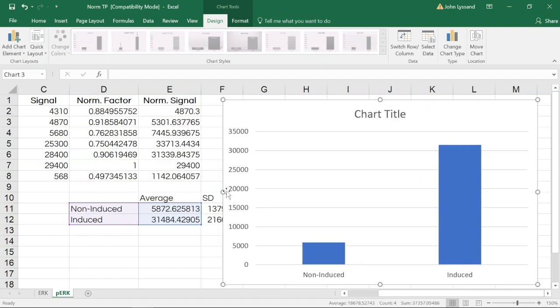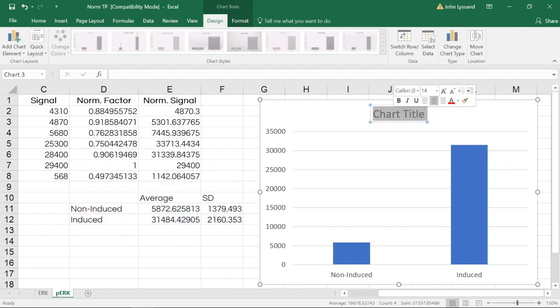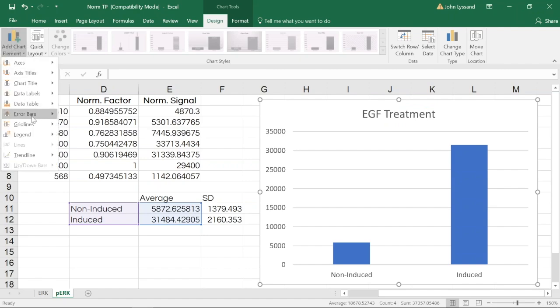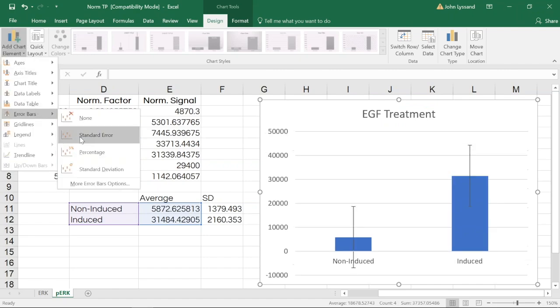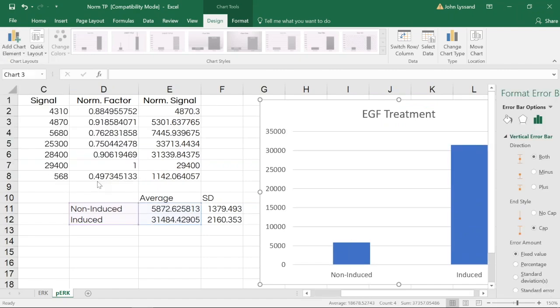Here if we want, we can adjust our chart size, we can add a title. And since we've also calculated our standard deviation, we can add error bars to highlight that standard deviation.